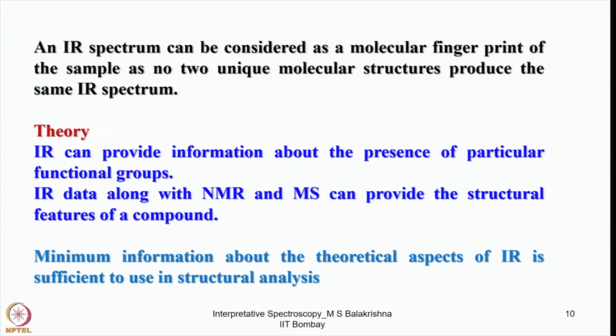It may not be possible to understand all the peaks present, and one need not worry about interpreting all the absorption peaks that are seen in that region. But what one should remember is that this fingerprint region is characteristic of molecules. So what is the theory behind infrared spectroscopy?